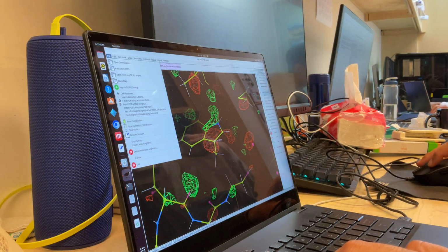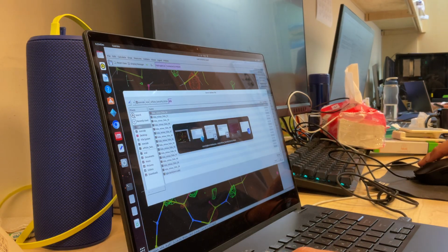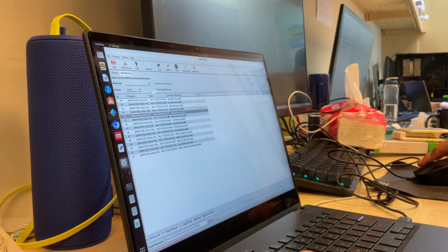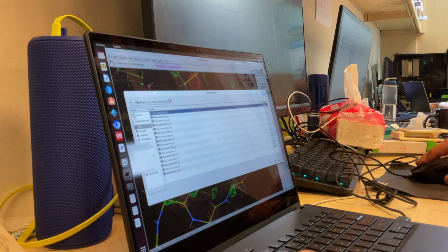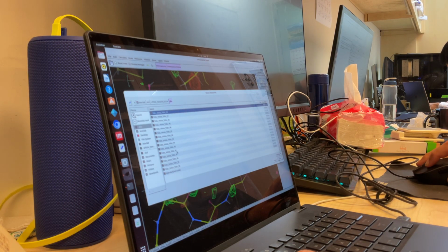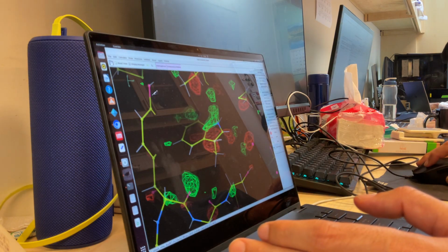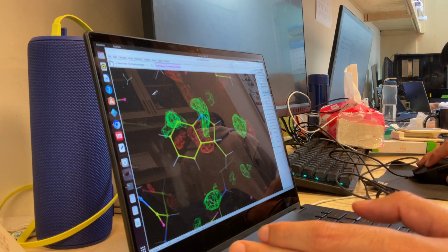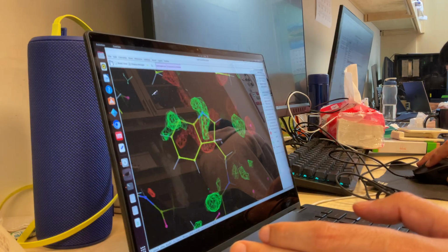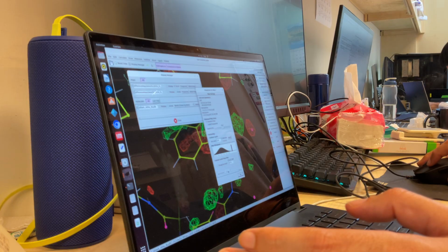So we can open, what was it? Refinement 8. Sorry, FOBS 8, wasn't it? 42. Yeah, the old 42 one. Okay, so we take 42. I just want to do the comparison to see how the difference looks. So we can take, which one is this one, color.